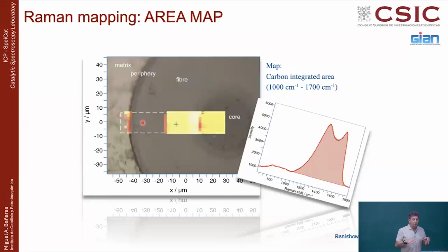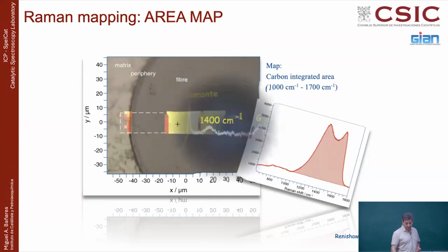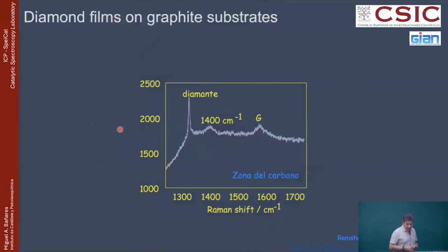So mainly with Raman imaging, you can get this kind of information at different coordinates. And again, like we saw before, when you go out of the fiber and you're still measuring there, you will see a few bands of something, which again is carbon, but this is actually you see the debris out there. So these are like these particles from broken carbon fibers that remain at the outermost, beyond the outermost surface of this material.